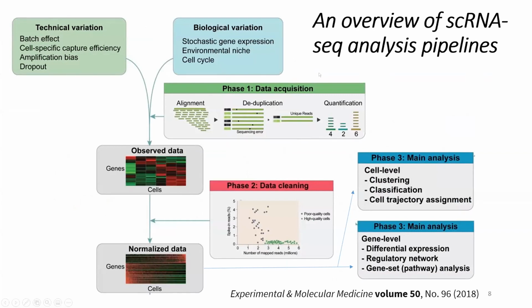And here's an overview of the single cell RNA-seq analysis pipeline, which I believe the rest of the tutorial will give you a very good idea. You start with the data acquisition, and then you do data cleaning. I'm going to talk a lot about data cleaning. And then there's the main analysis that involves clustering, classification, trajectory assignment. But today I'll just focus on the clustering. And then there's a lot of analysis that's more downstream. I believe Zongliang, our fourth speaker, will mention a little bit of that in his tutorial.